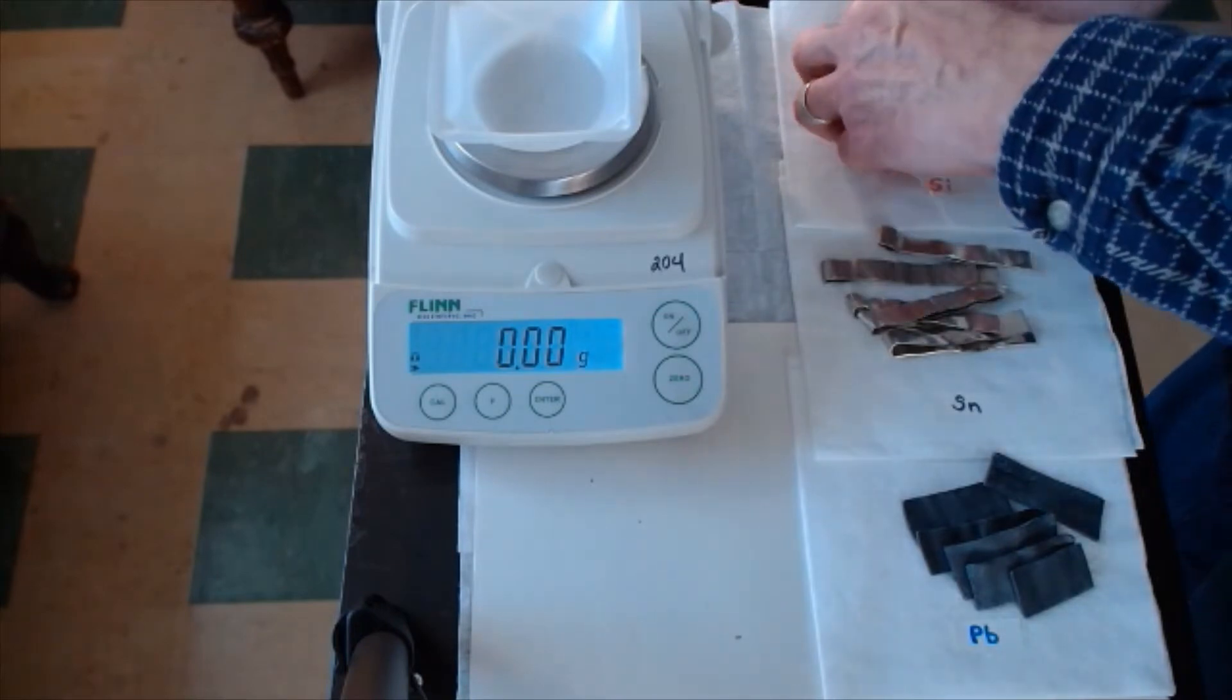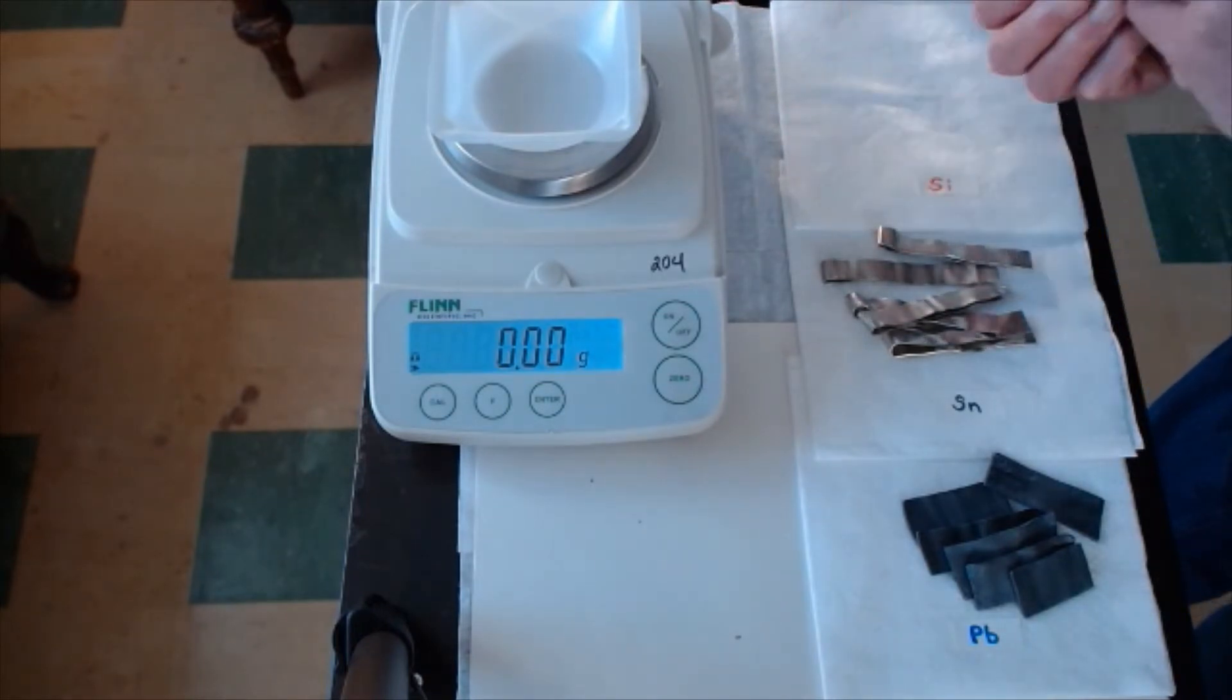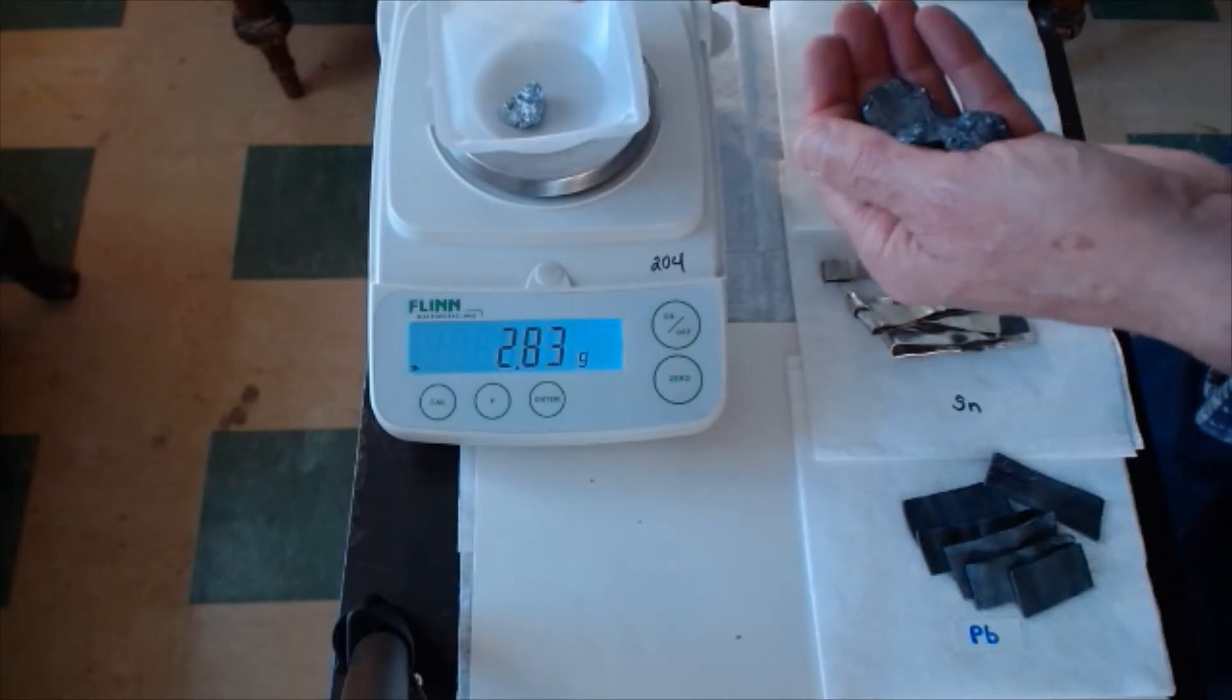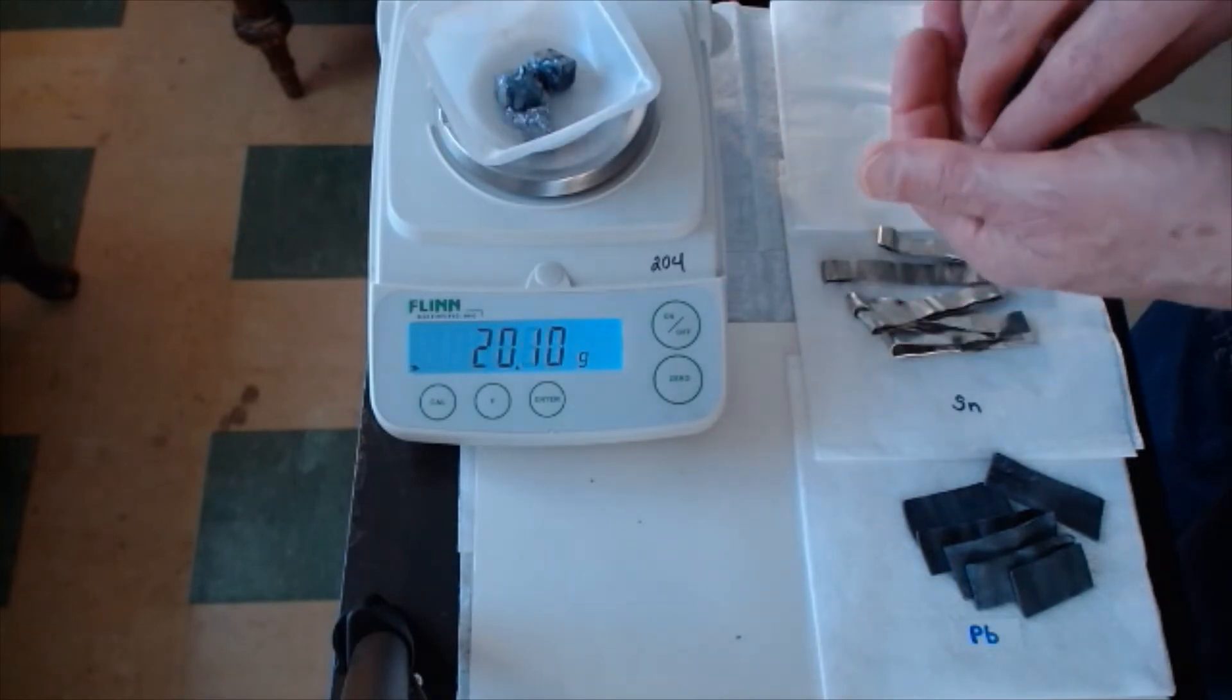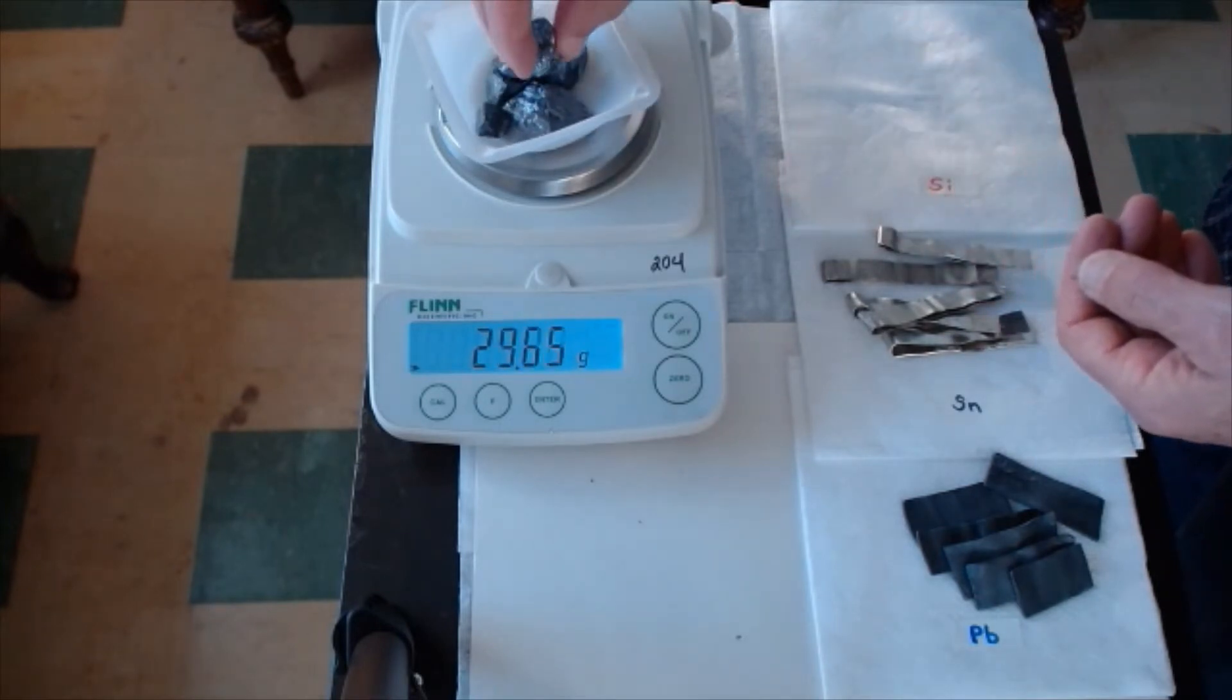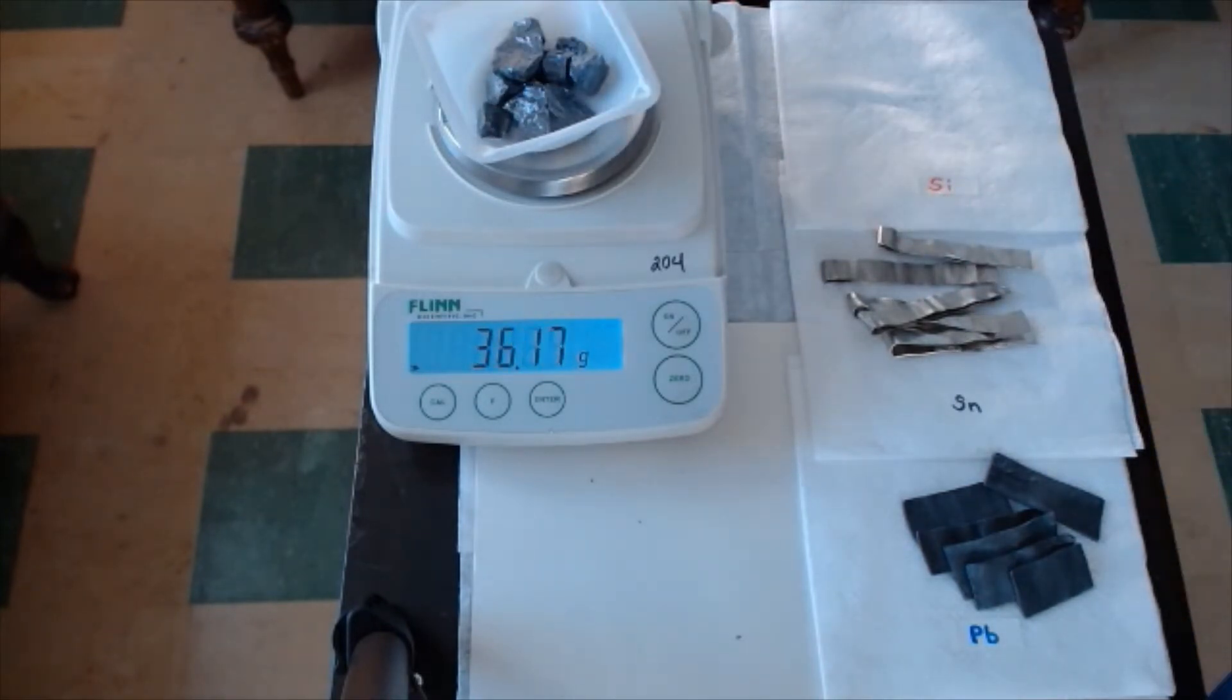Let's weigh the silicon pieces first. I'm just going to put them all on here. And then we'll wait for the scale to settle down, and you can record the mass of the silicon. There it is, 36.17 grams, the mass of silicon.